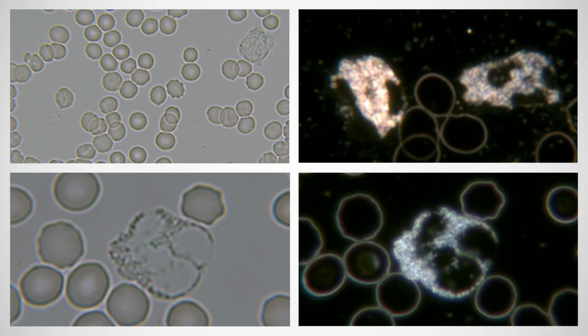So we can see some examples there of what the white blood cells would look like in dark field, and very important to be able to get a proper level of magnification here. You can see the top left-hand side image there, slightly lower level of magnification than the rest of the images there. So the image right at the top left-hand side is actually the magnification that we use for identifying most of the live blood anomalies, and that's about 1,600 times with our specific microscopes. The more magnified images there are about 4,000 times taken with our 100 times objective.